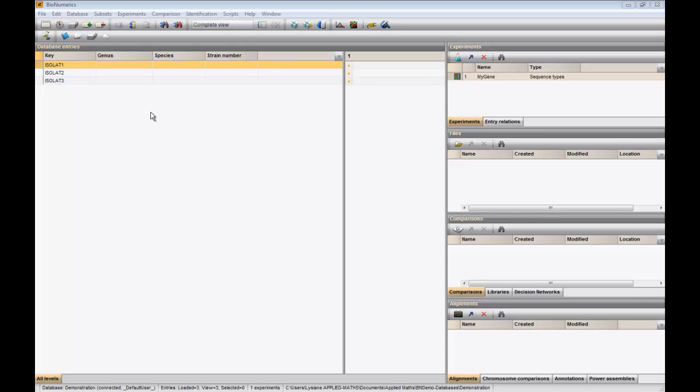In this video, we will process a Kontig assembly project and save the consensus sequence in the Bionumerics database.